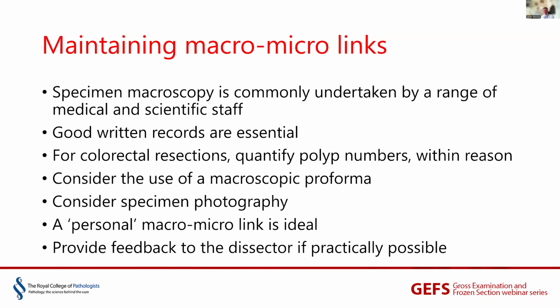Now, I know that some people say that you shouldn't include a block description in your standard pathology report. Some people say you should have your department SOP that would indicate what blocks you should take and what blocks have been taken. Other people suggest you should have your block description within part of your laboratory information management system, part of your pathology computer, that is visible to pathologists, but is not necessarily present in the actual report. But I think most departments would actually include a succinct block description. So whatever it is, whoever's reporting the case needs to understand where the blocks are taken from clearly.